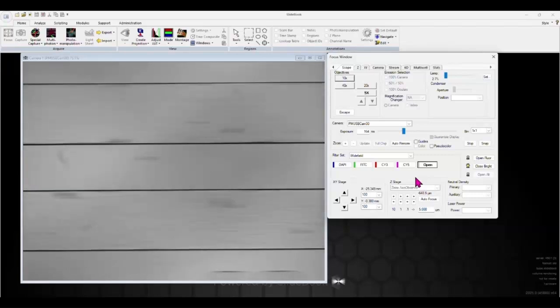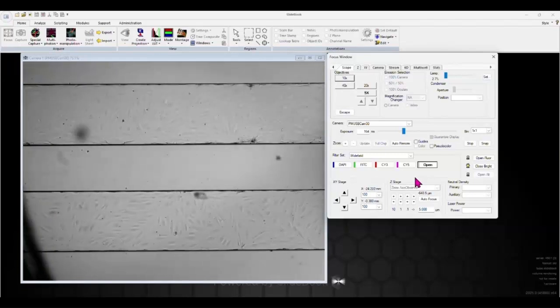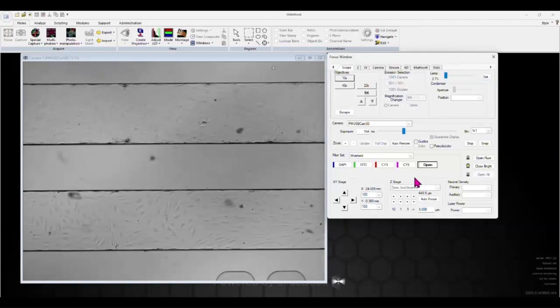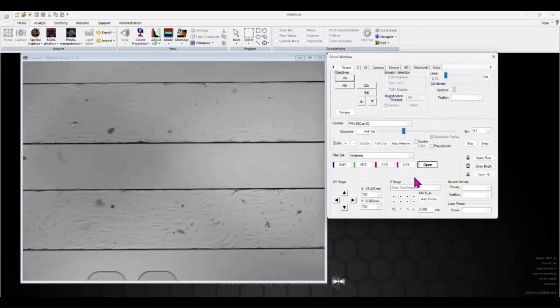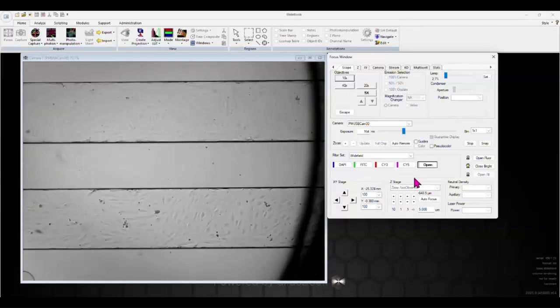To seat the plates, we coated the microfluidic channels with 100 micrograms per ml fibronectin, then seated the cells a day in advance to let them attach and form a confluent monolayer. Each microfluidic flow cell was loaded with 50 microliters of a cell suspension with a concentration of 10 million cells per ml. To seat a full plate, you typically need 10 to 20 million cells per ml. If confluency isn't reached overnight, you can feed the cells every day with fresh media until they reach the desired confluency. In this experiment, we're comparing two conditions.